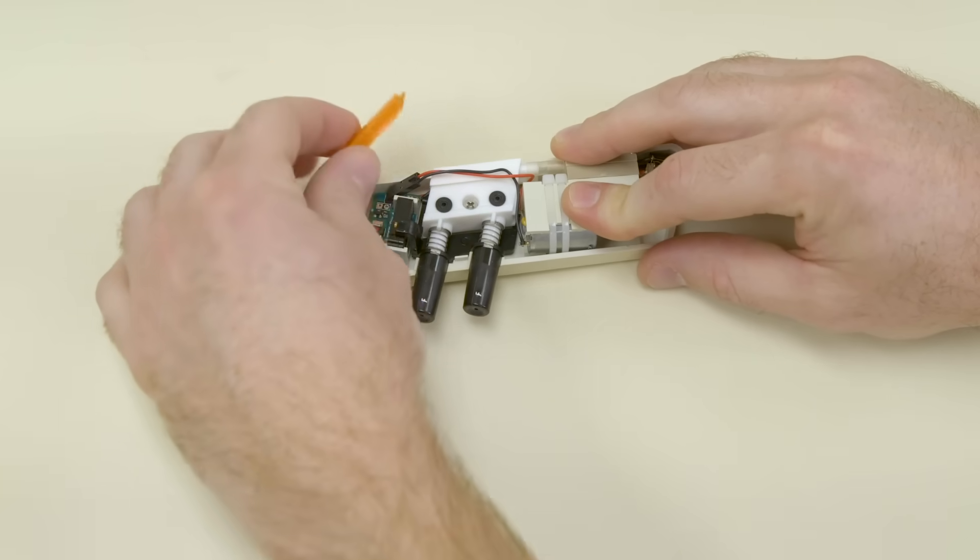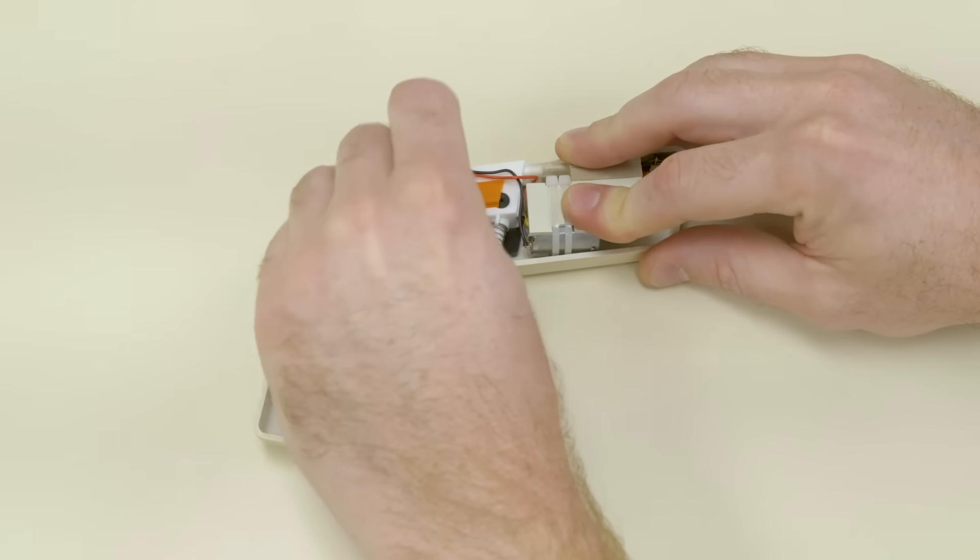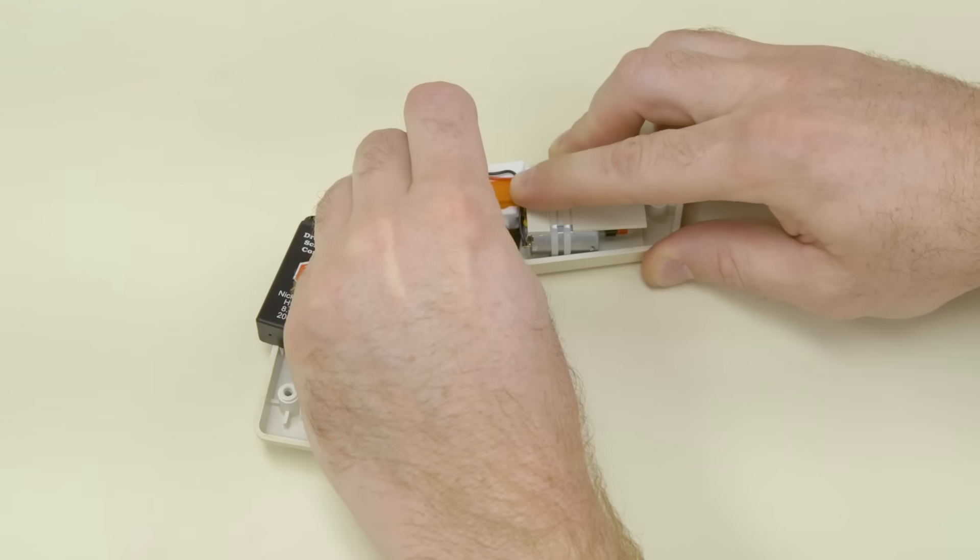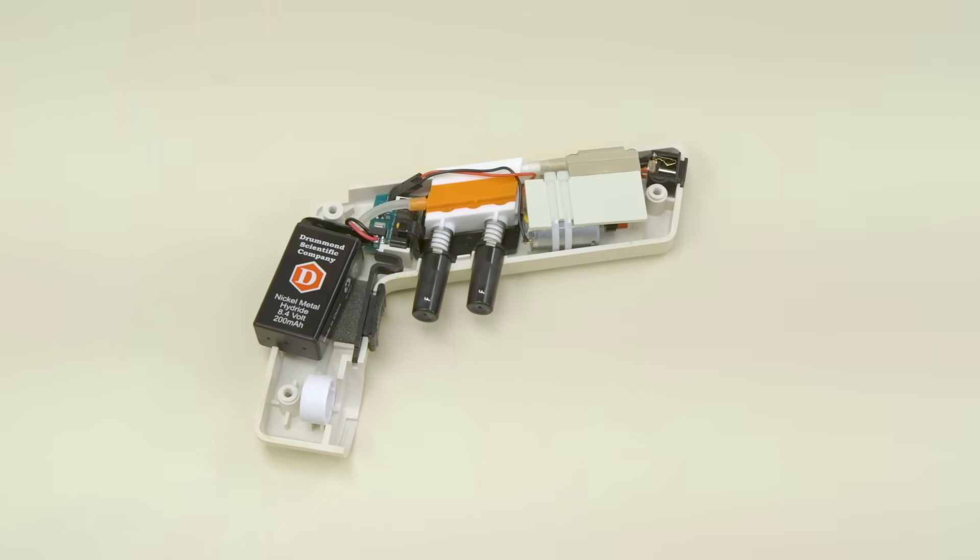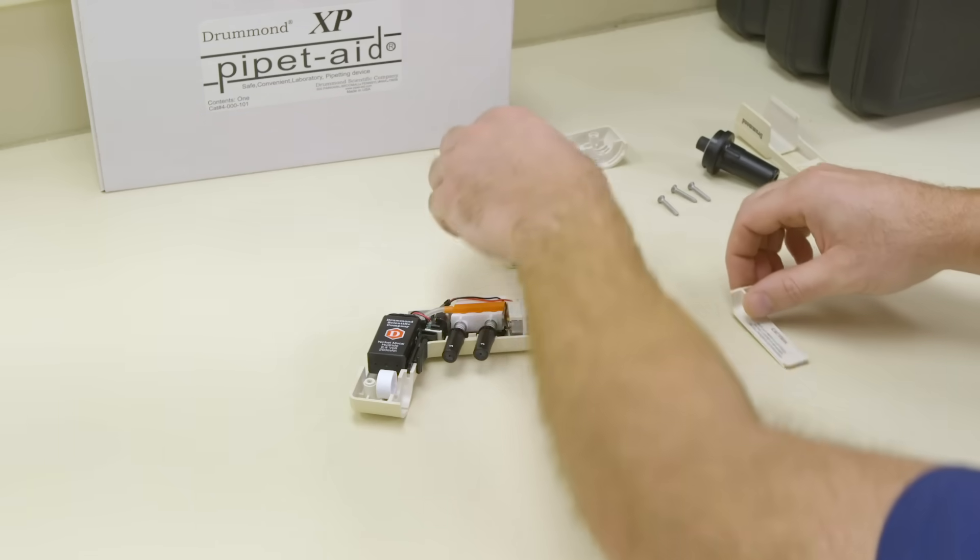Now slide the cover back into place, making sure it is even on both ends of the valve body. Then put the device back together.